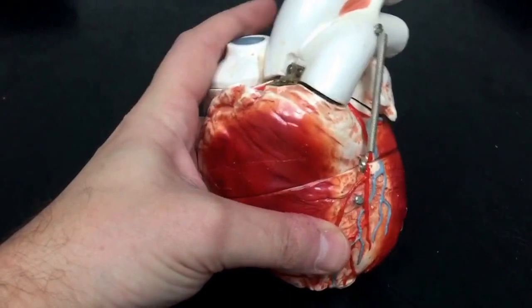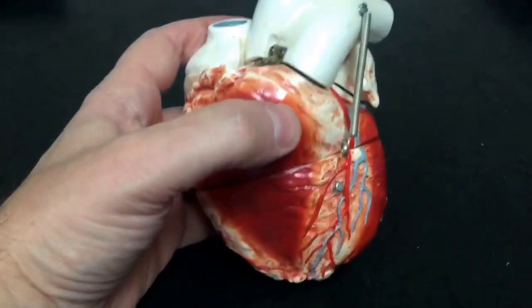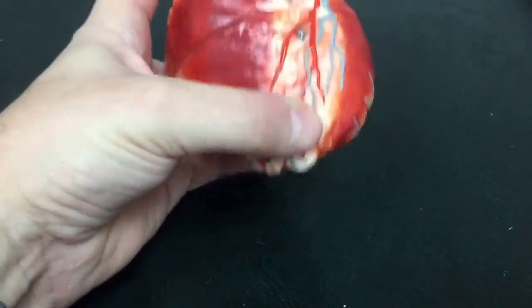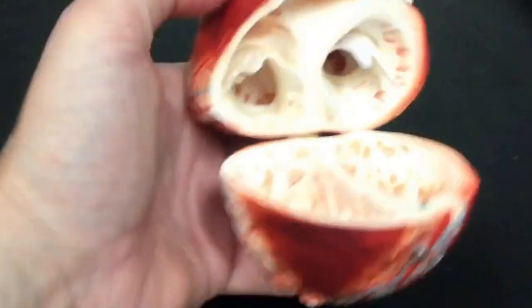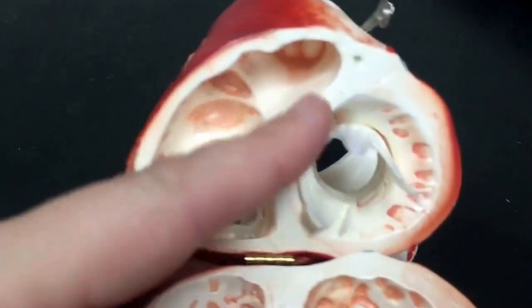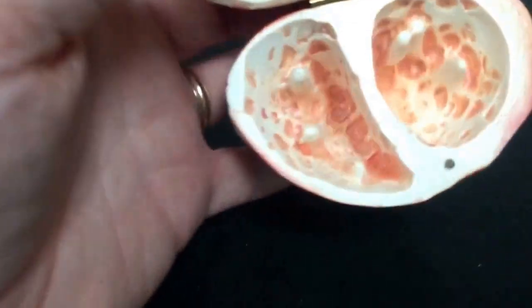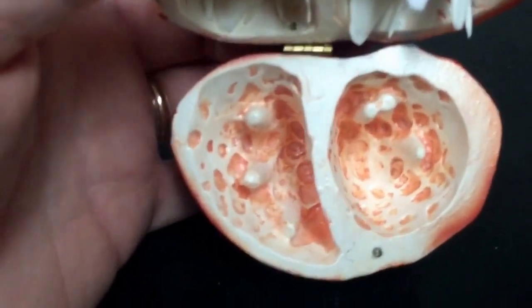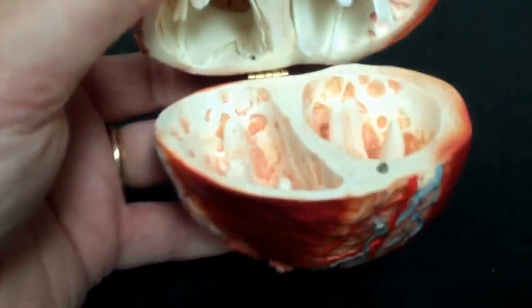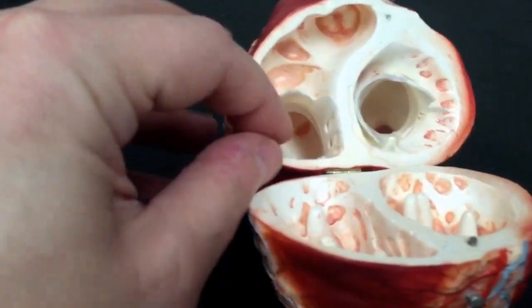Now let's follow the path of blood through the heart, and we'll start here in the right ventricle. They're running down the middle. You can see the interventricular septum here and here. So the right ventricle is on the left side of the screen, you see. This valve here represents the tricuspid valve.